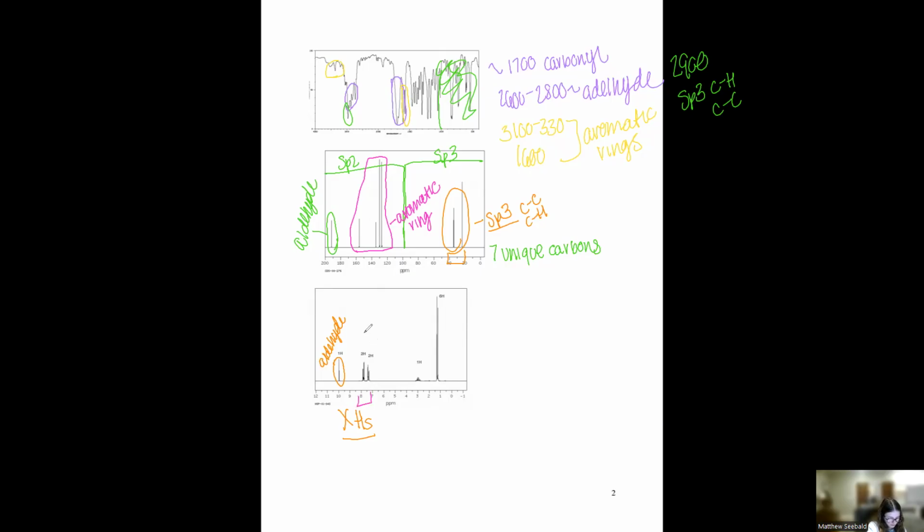Seven to 8 ppm is consistent with our aromatic ring, which has a total of 4 hydrogens. Given that there's typically 6 hydrogens, this tells us that this ring is di-substituted. To find out the orientation on the benzene ring, we have to look into the splitting. Since both hydrogen groups split twice, they're both known as doublets. The only way to have 2 doublets on a benzene ring is if the substituents are arranged directly across from each other, or symmetric.